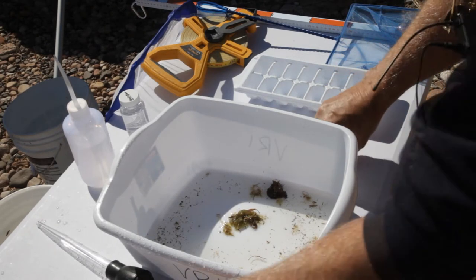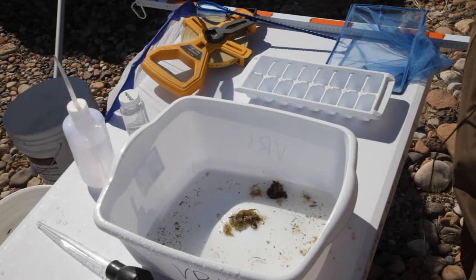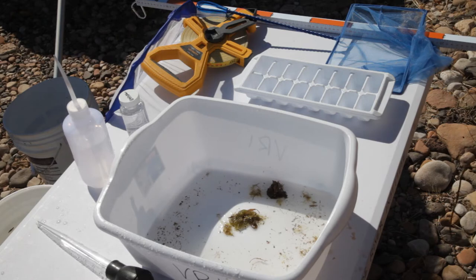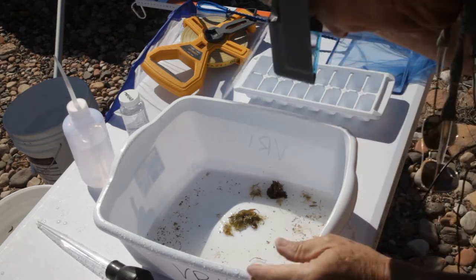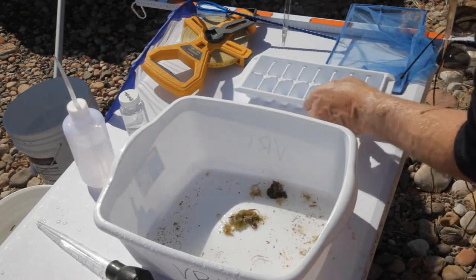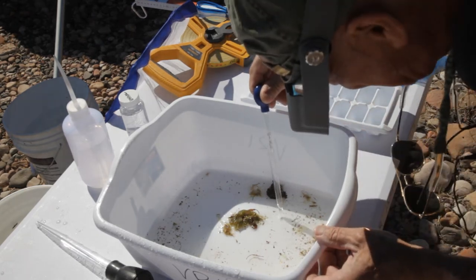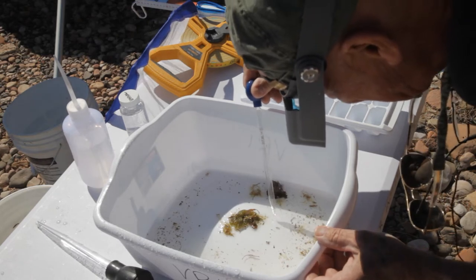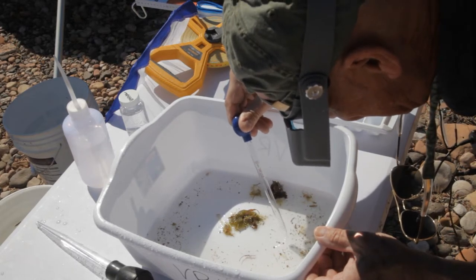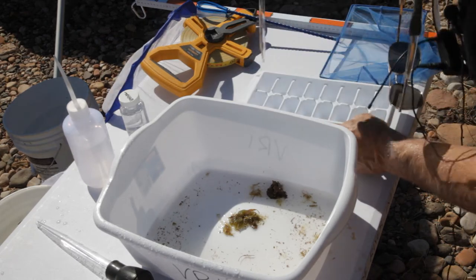We're going to wear this magnifier on our head so that we can see a little better, especially those of us with older eyes. We're going to begin to grab each of these little guys — that's a mayfly larva, so we're going to put it in one of those compartments. Now there's a little caddisfly, so he goes in a different one — caddisflies are over here, mayflies in that one.